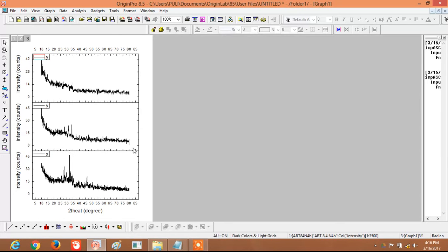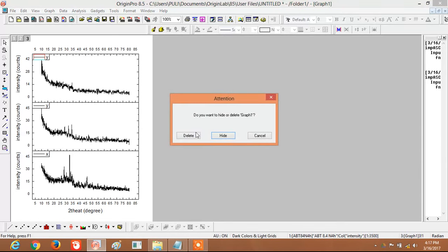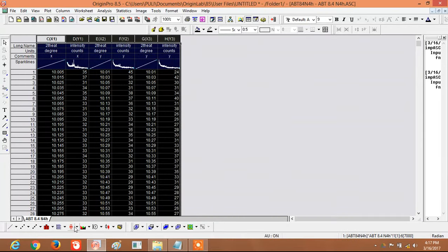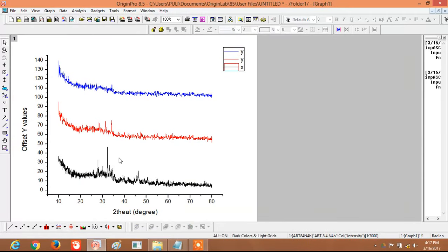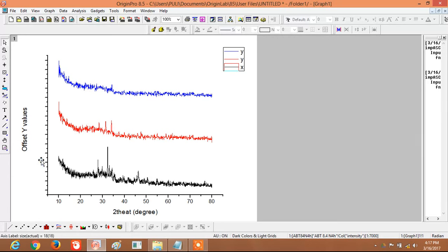This is the resulting stacked graph. Another way to display the graphs is to use 'Stack Lines by Y Offset'. When drawn with Y offset, the Y values are not exact values — they are offset values. Because of this, we should note that the intensity is in arbitrary units.